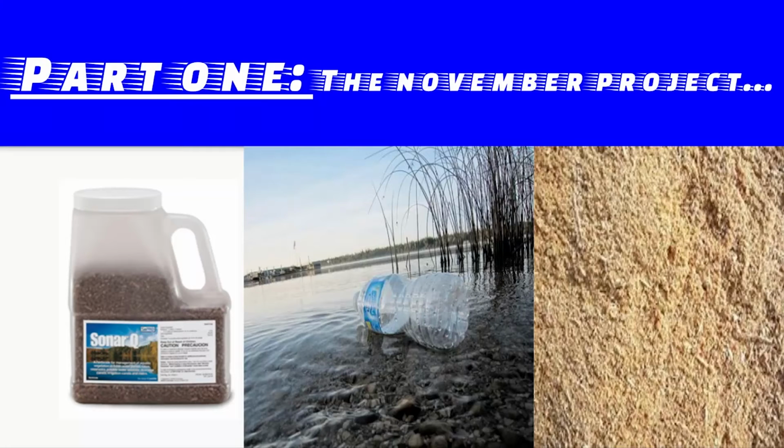The November project was about testing how long it took different pollutants to diffuse into water. Our question was, what will be the alkalinity, pH, and chlorine level of the polluted water after 3 weeks of sitting? This project took place between November 21st and December 13th, 2017, although the project was later extended to January 9th for all of the samples except the control water.